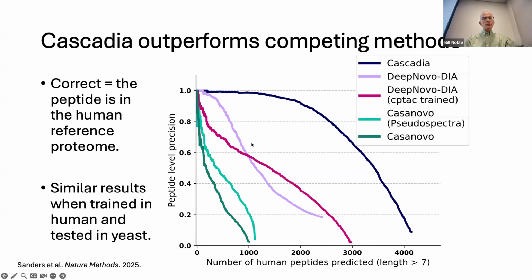But the lighter green line here is a variant of that, which a priori you might expect to work better. There is a standard way in DIA processing for extracting what are called pseudospectra, where you basically look at the isotope distribution and do a deconvolution step to pull out all of the fragments that are associated with that isotope distribution. And that's actually how existing methods work.